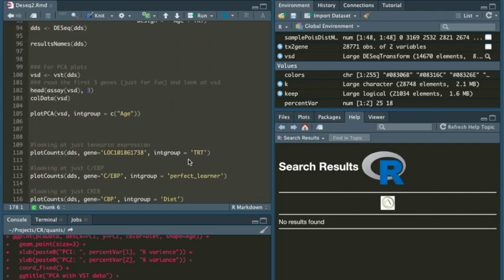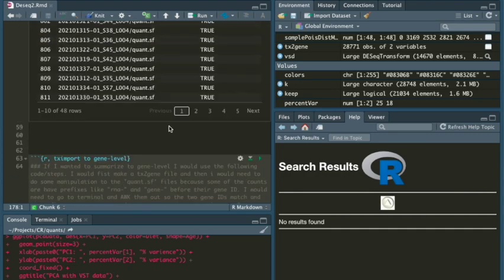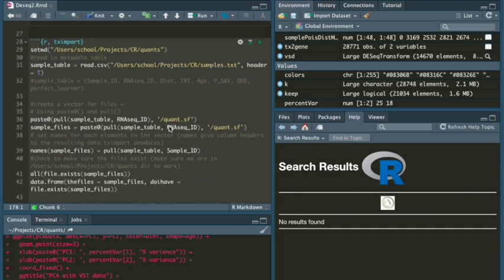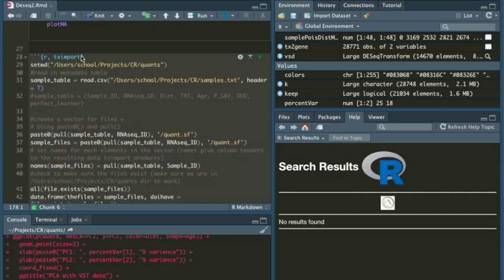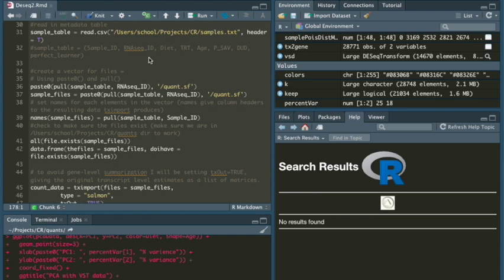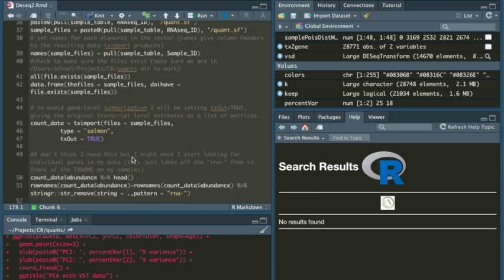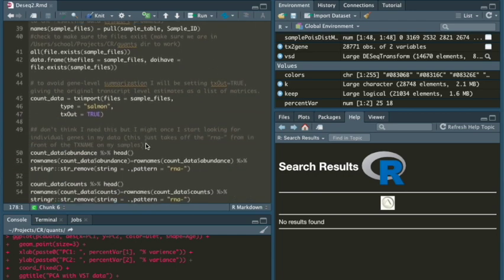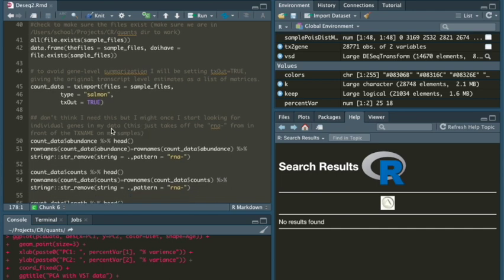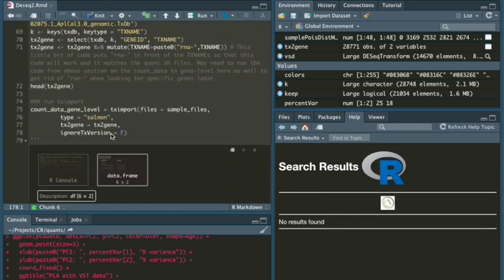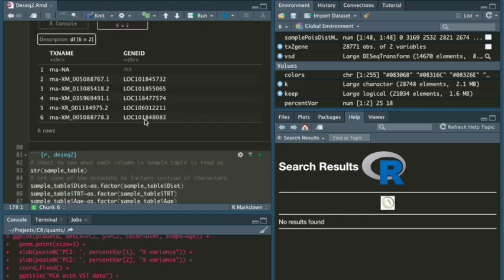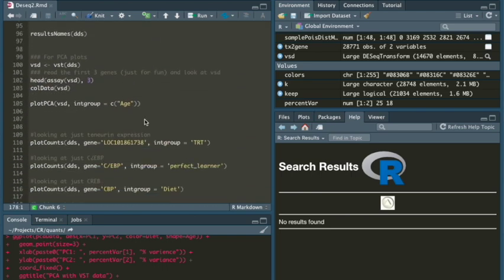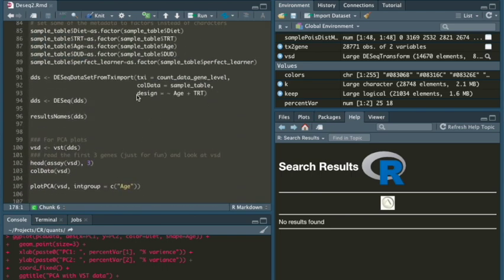Okay, so this is the graphical interface program R. This is some of the code that I've been writing. I've been working with my samples for AIM2, doing gene expression on Mach 48 samples. I had to run it through some things. So I had to import it. I remember I was talking about TXI import. So I set my working directory, made a table of the sample names, pasted the quants files into that, made sure they existed, and then imported it with this nifty thing here. This was mapped to the transcriptome. I then changed it later and mapped it to the genome.